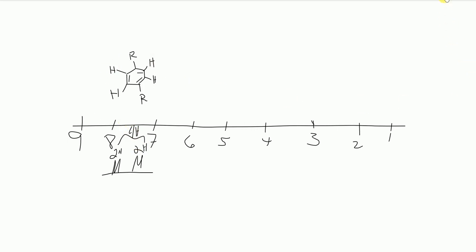Okay, and to correspond the peaks to the molecule, what we essentially have is a symmetric molecule straight down the middle. So the things on this half are symmetric.